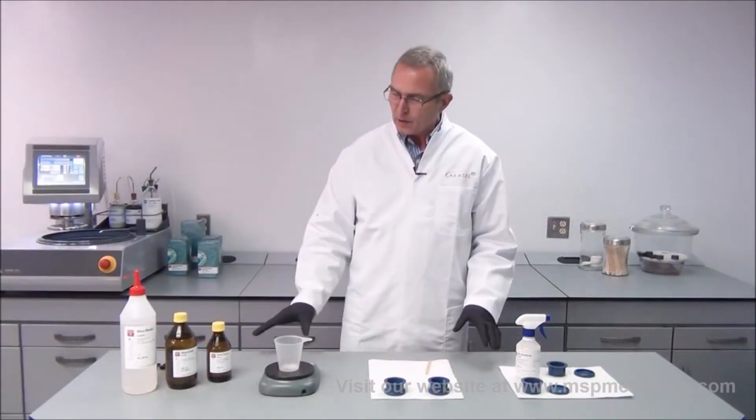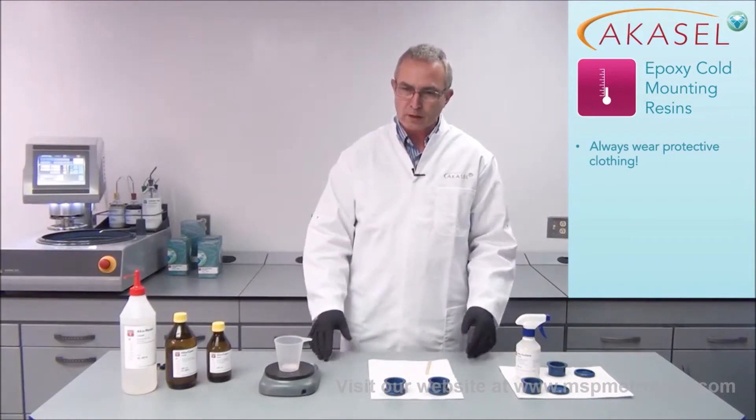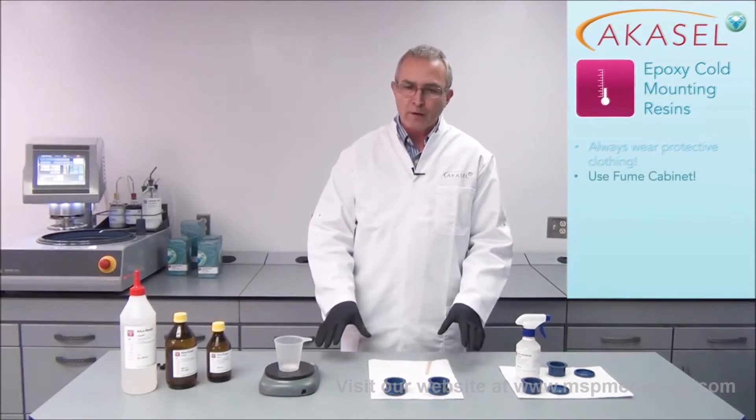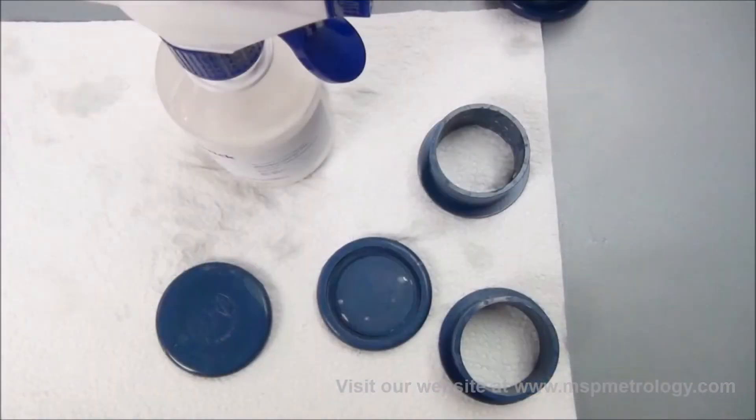Before we start actually using the epoxy resin, it is very important that you wear protective clothing. You should wear gloves, goggles, and a lab coat, and this should also be done in a fume cabinet — but for video purposes we are doing that without today.